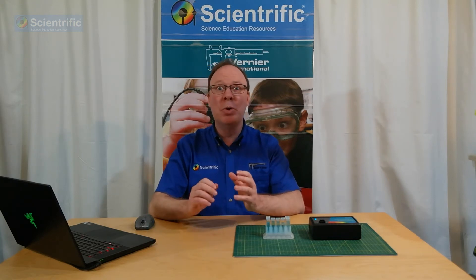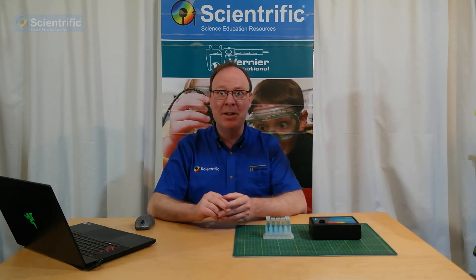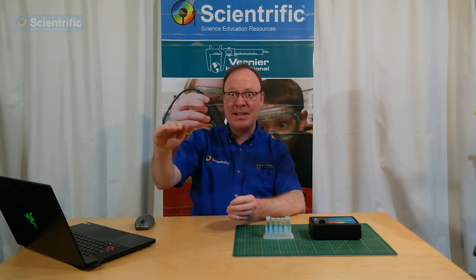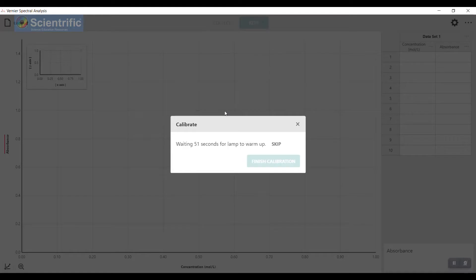It is important to let the light on the inside of the spectrophotometer warm up — you will get much better results that way. If you ever find that you're having difficulty getting a good baseline, this will probably be the reason why. Because it does take a little bit of time to warm up, using the magic of the video, we'll just speed this up a little bit.